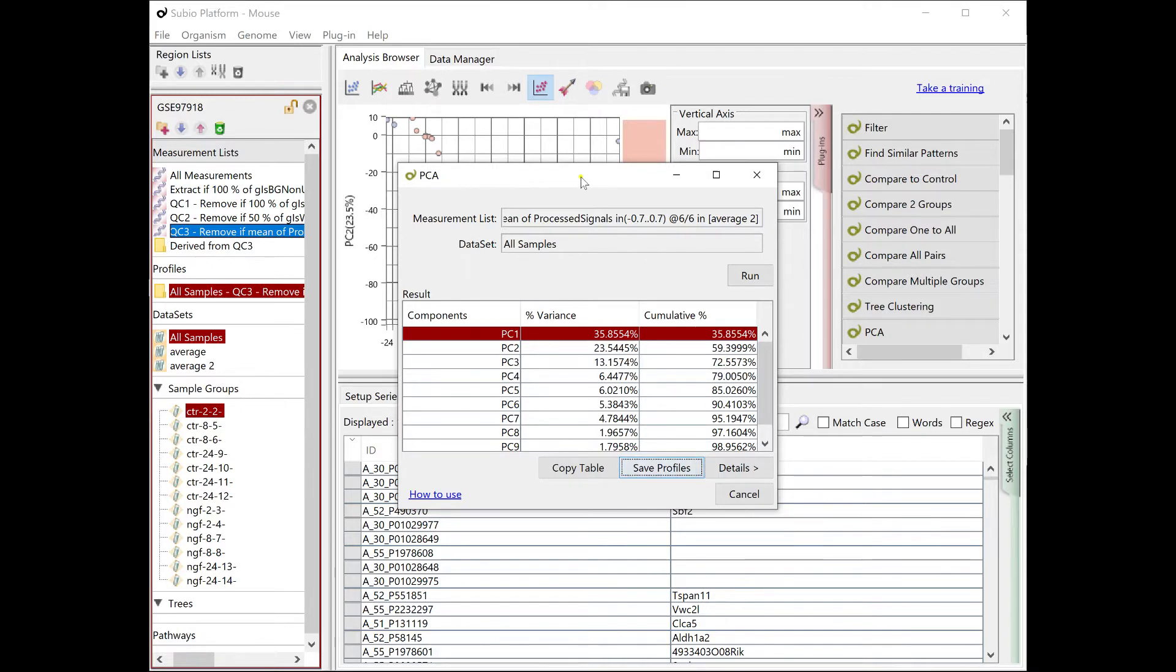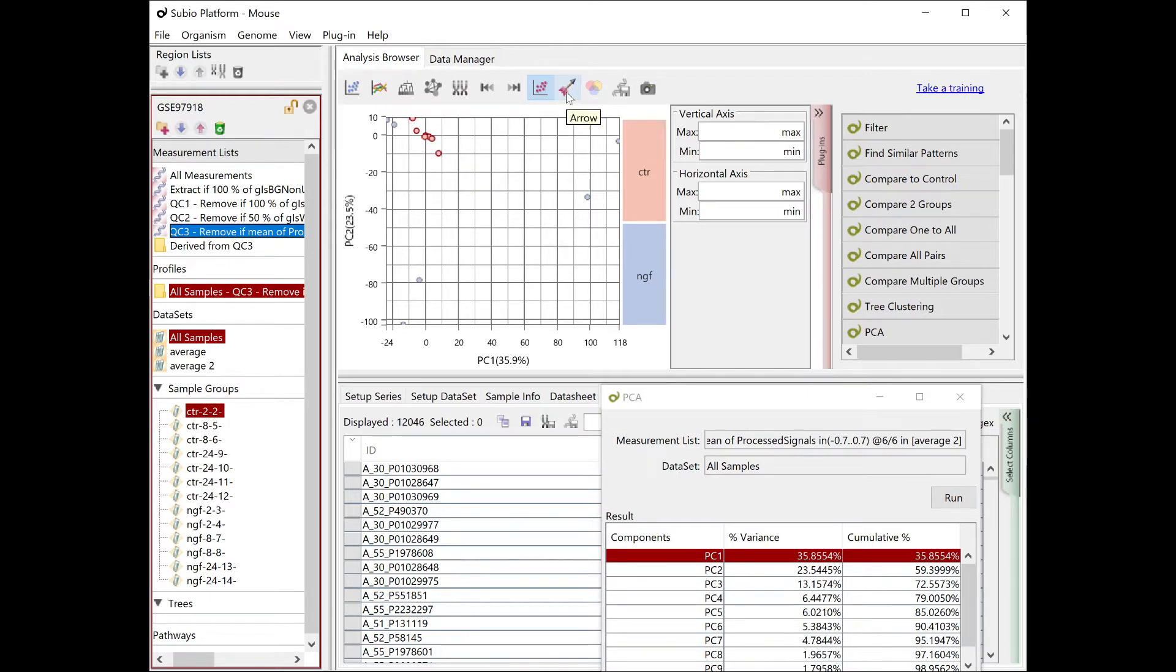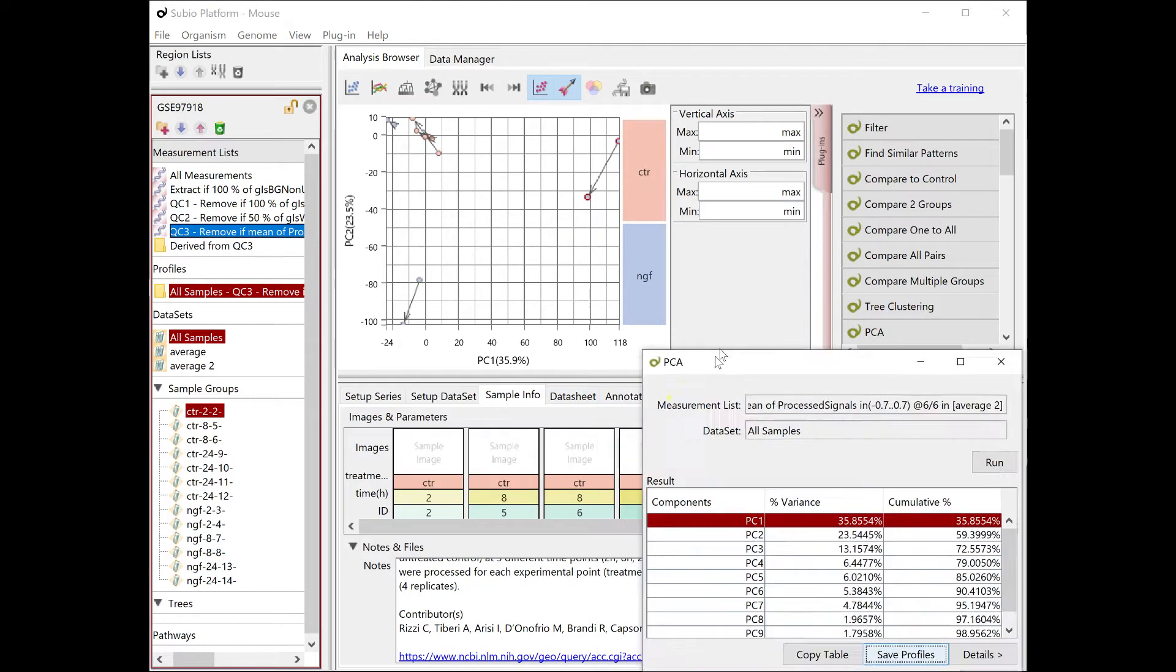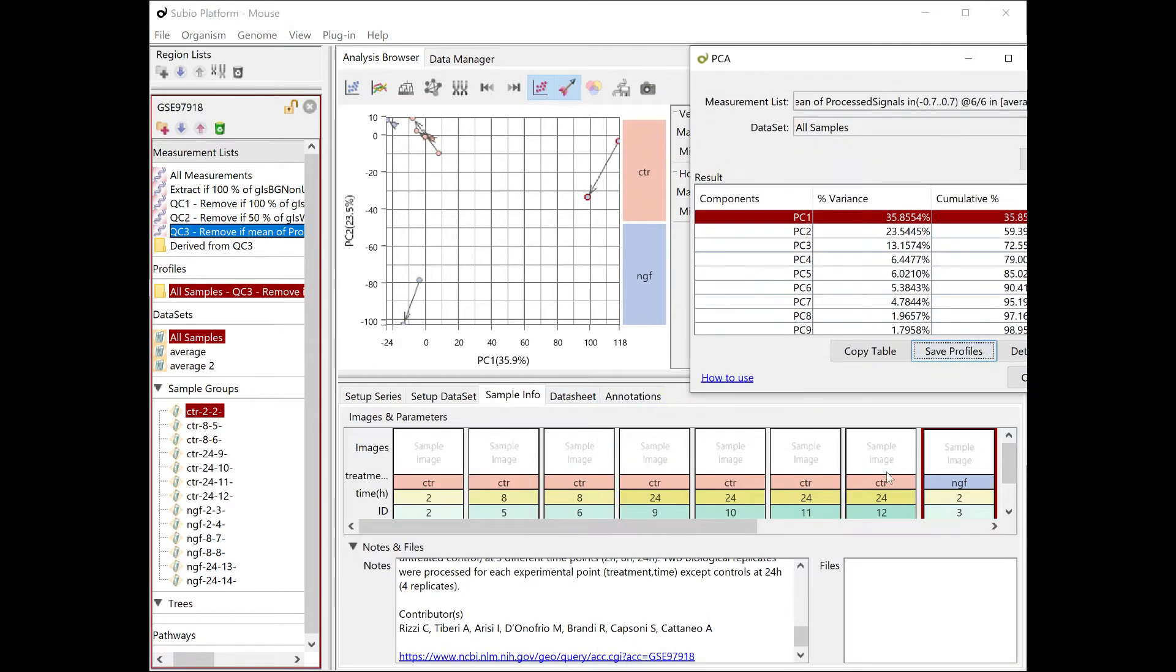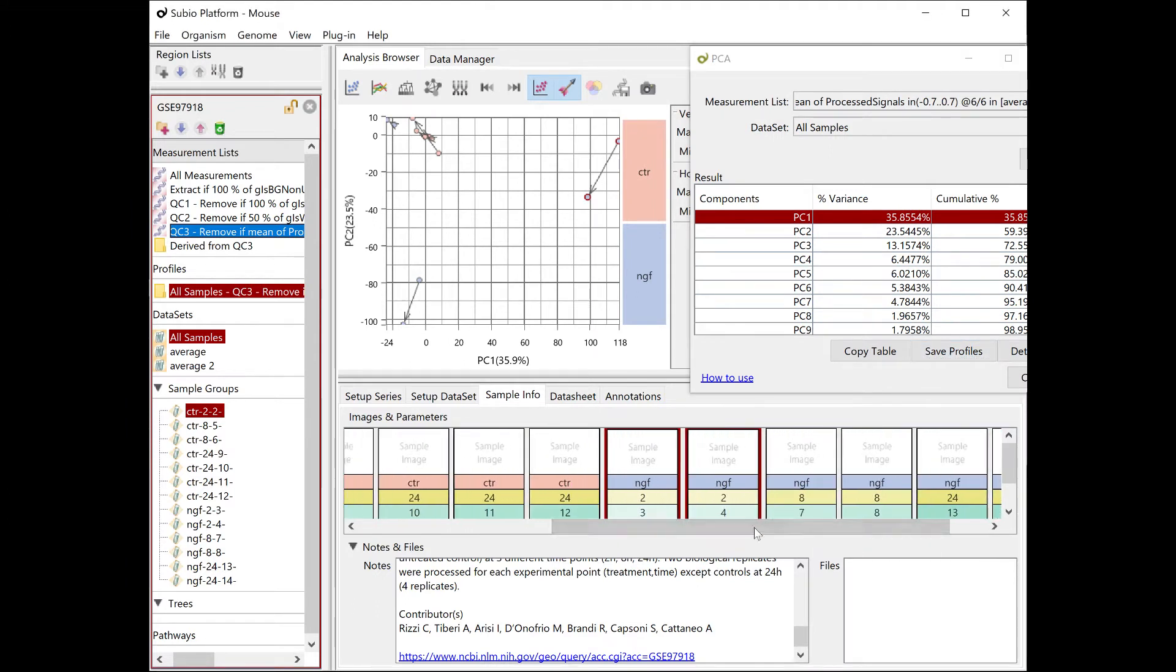In the scatter plot, the origin is near the left top, and the control samples locate around it. The two samples near the right side, which contribute to the first principal component, are the samples at two hours after NGF treatment.